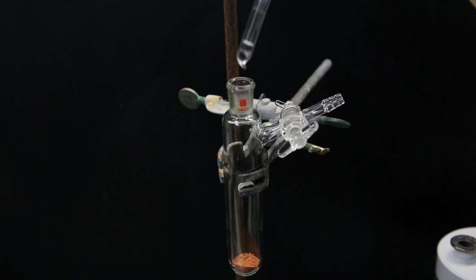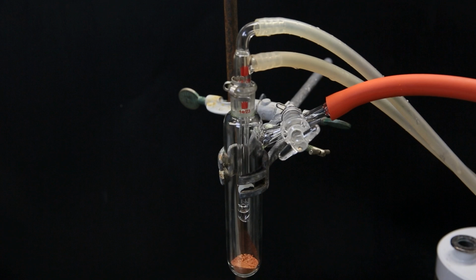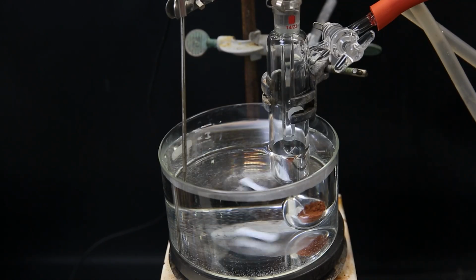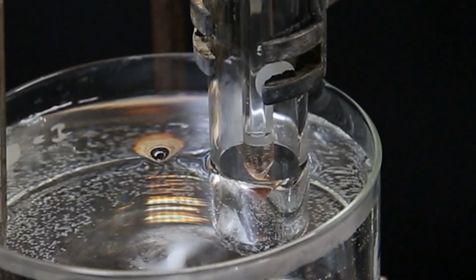I then attach a cold finger condenser, which is just a stick with cold water running through. I secure it with a small clip and connect the gas adapter to a vacuum pump. I then submerge the bottom part of the flask in a water bath that I heated to 40 C. I pull a vacuum on the flask, and in combination with the heat, it will cause the solid to slowly transfer into the gas phase, without becoming a liquid.